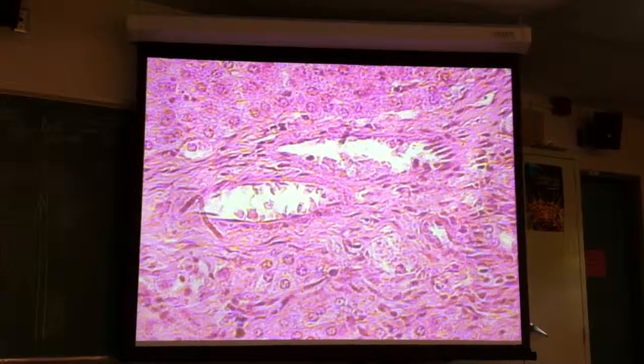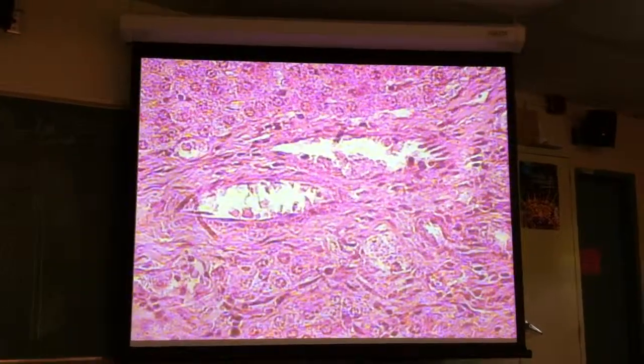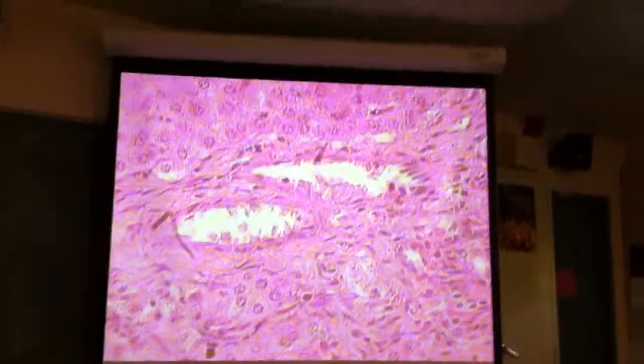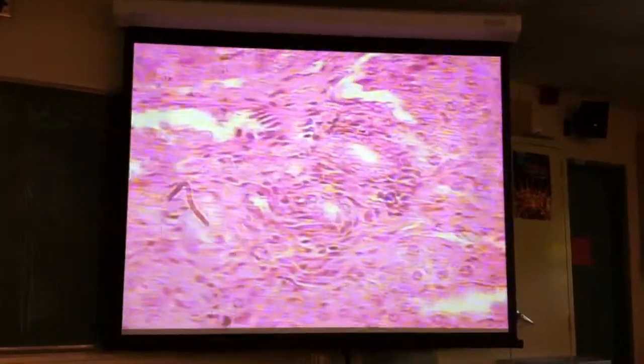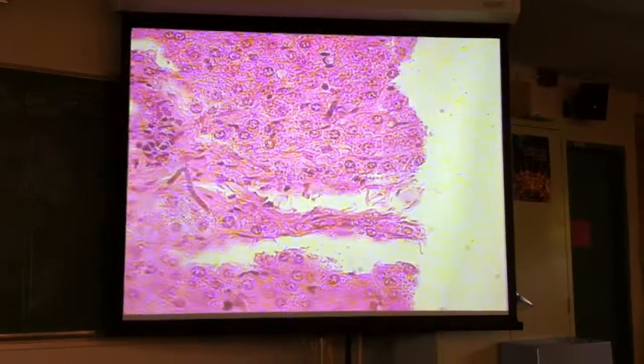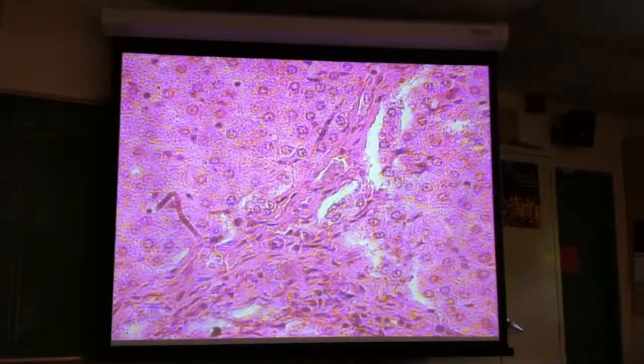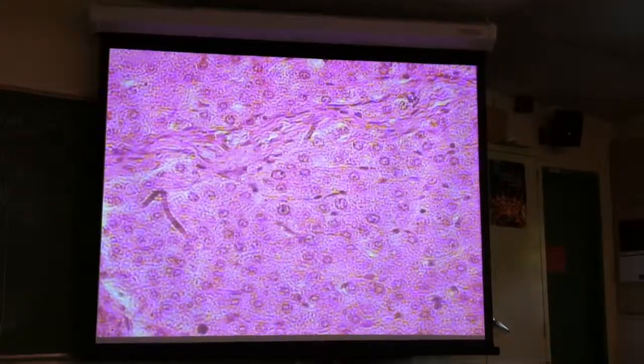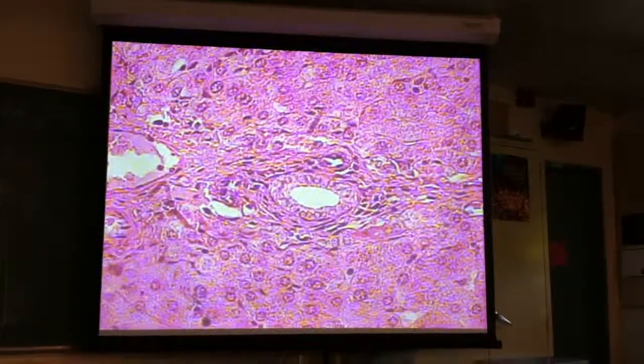I think both of those are hepatic artery as well. Looks like there is a bit of smooth muscle around them, although not as good as the other one. So you can spend a lot of time on some of these slides looking for good examples of each, but if you just keep in mind that if you see something with cuboidal epithelium, it has to be duct. There's a good duct and an artery side by side right there.